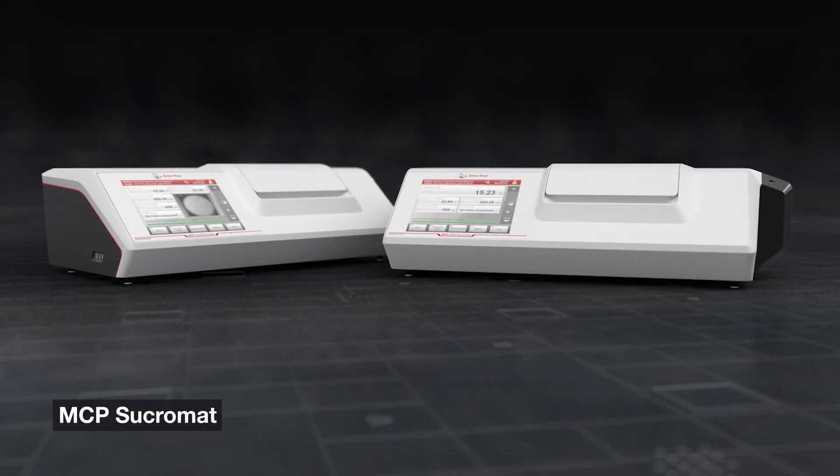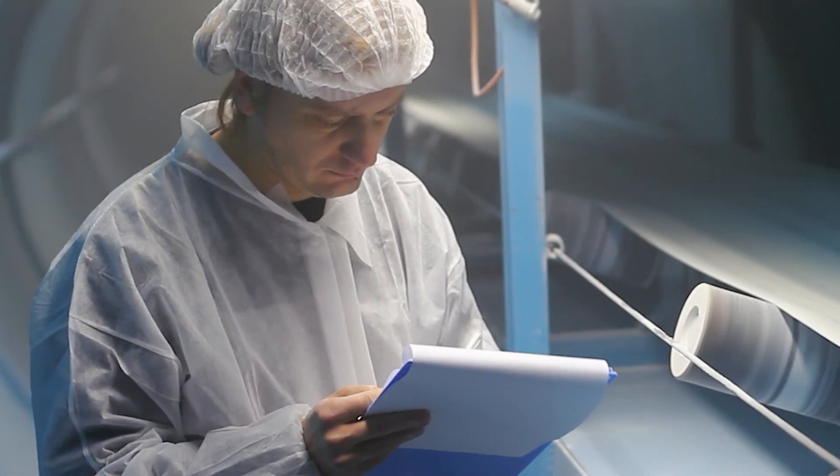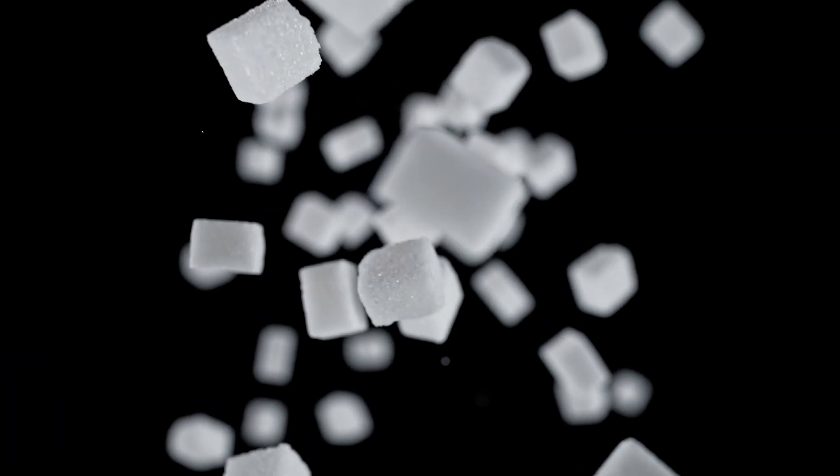The sleek, market-leading instruments we make, like Anton Parr's MCP Sucromat Saccharimeter to monitor every single manufacturing step and catch impurities.